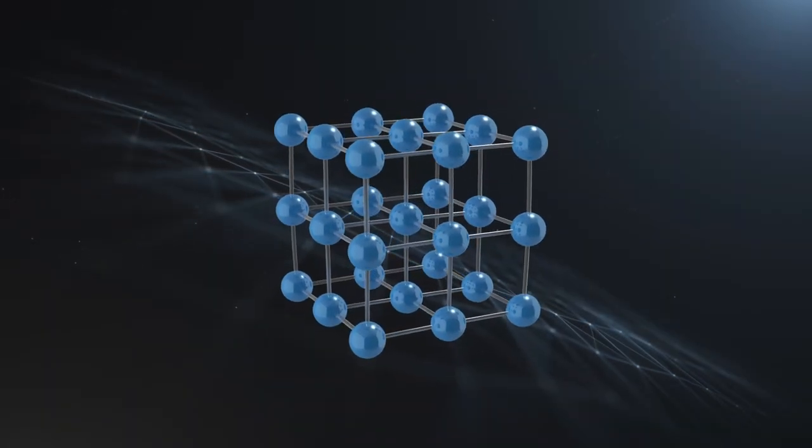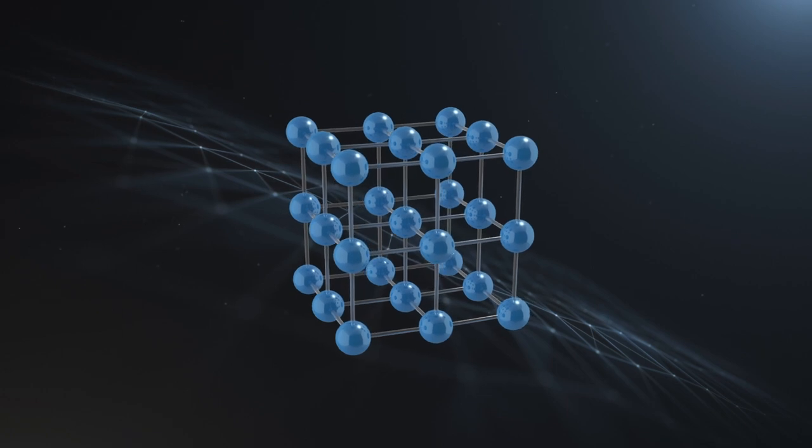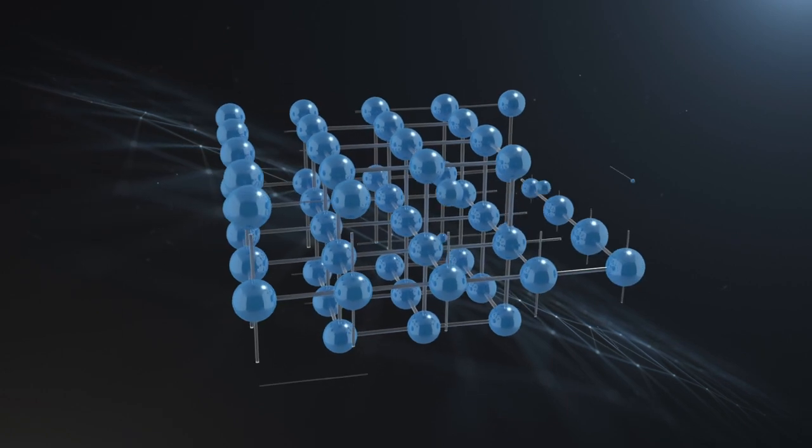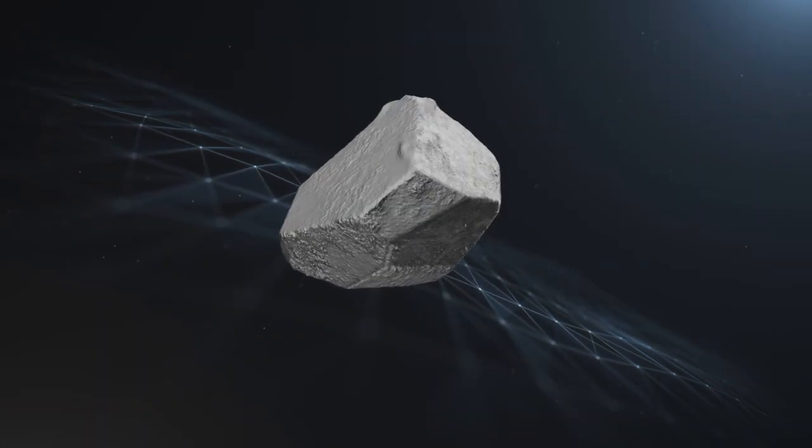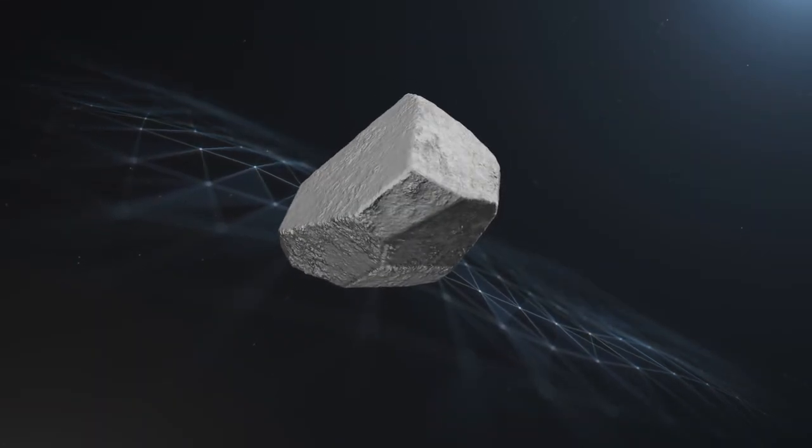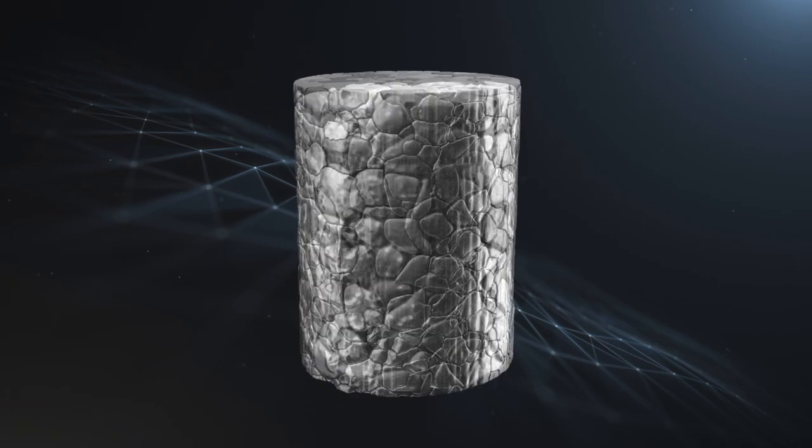In solids, atoms are ordered into a unit cell, called a lattice. Moving up a level, stacks of lattices form grains. Their size, shape and crystallographic orientation define the properties of a given material.